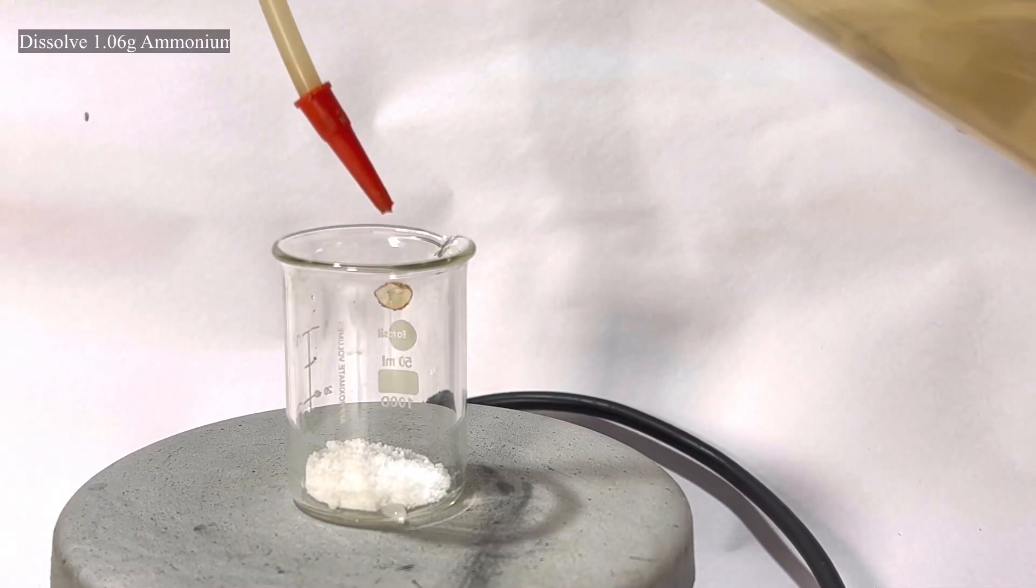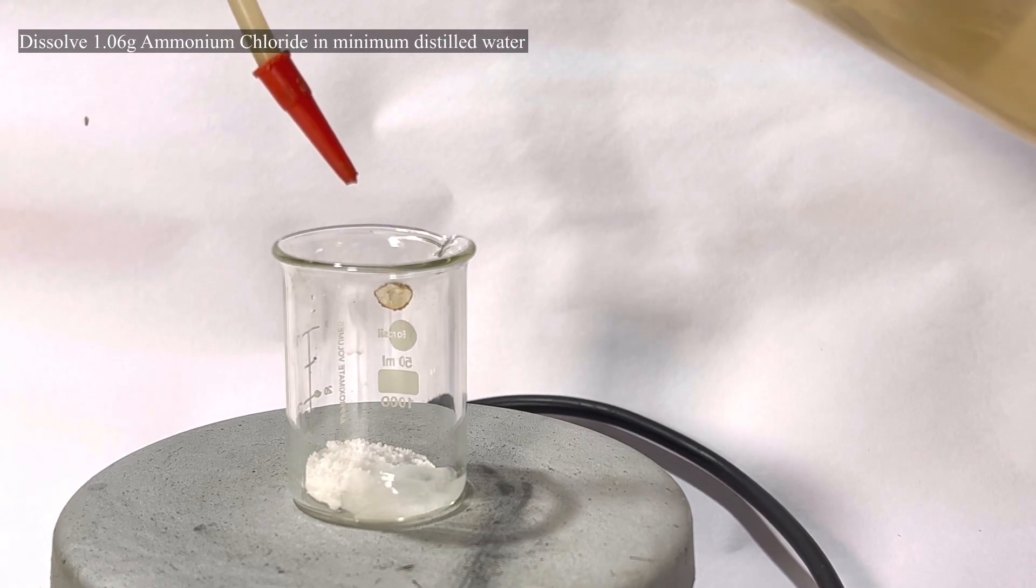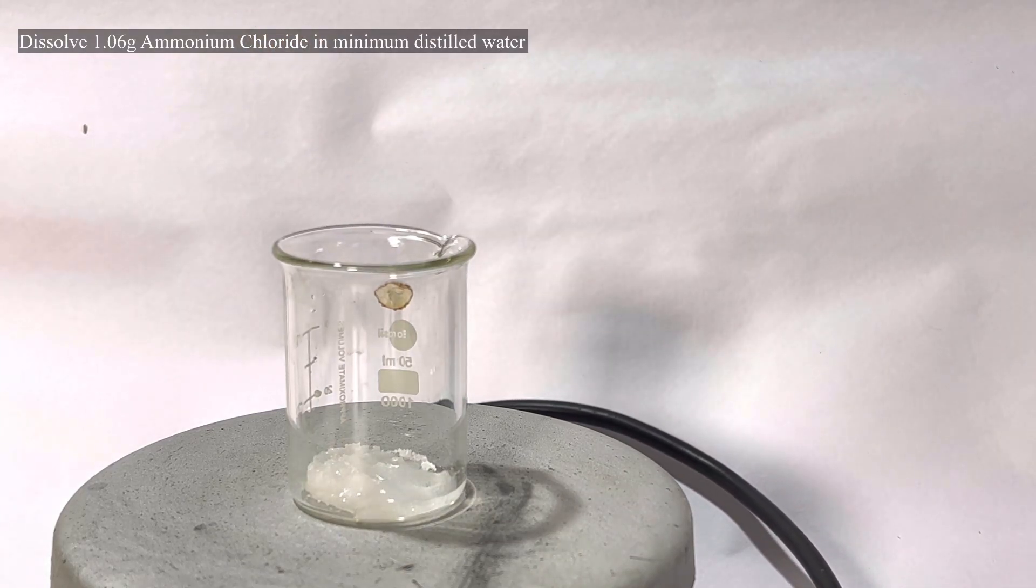Now prepare a solution of 1.06 grams of ammonium chloride in very minimal amount of water.